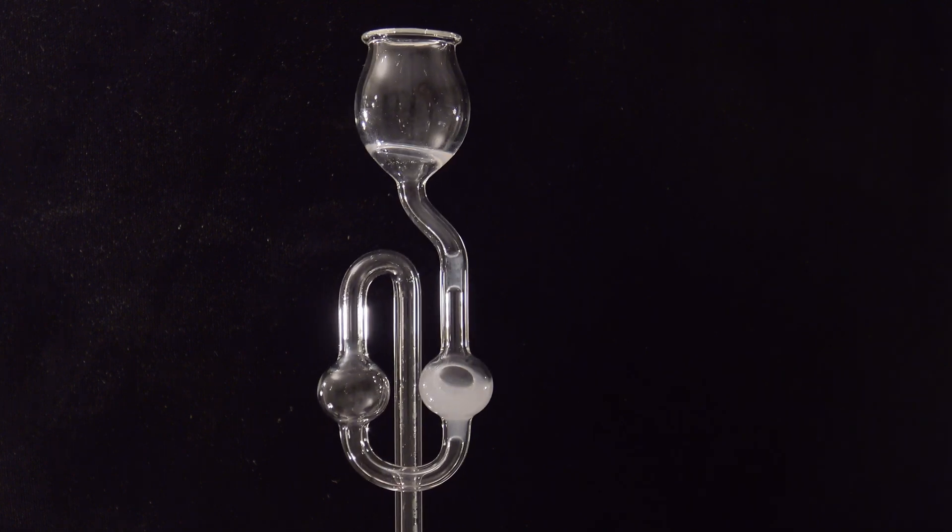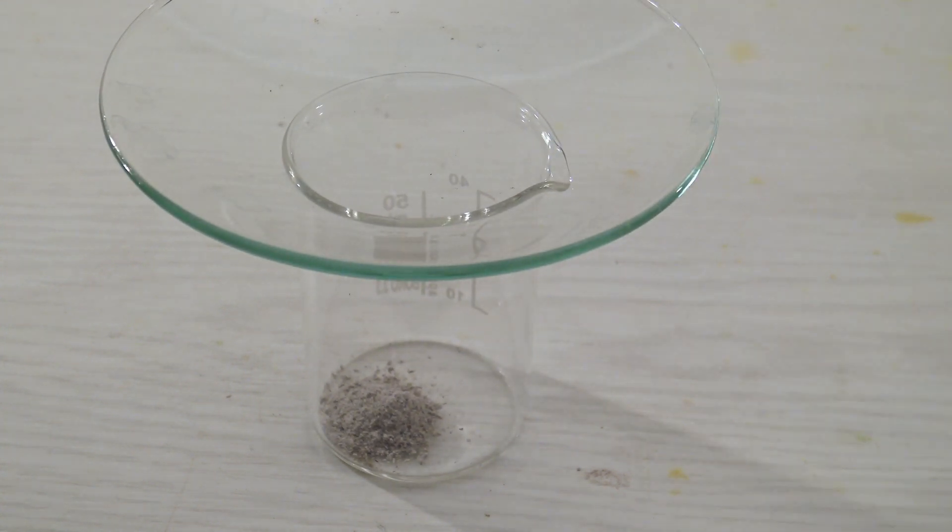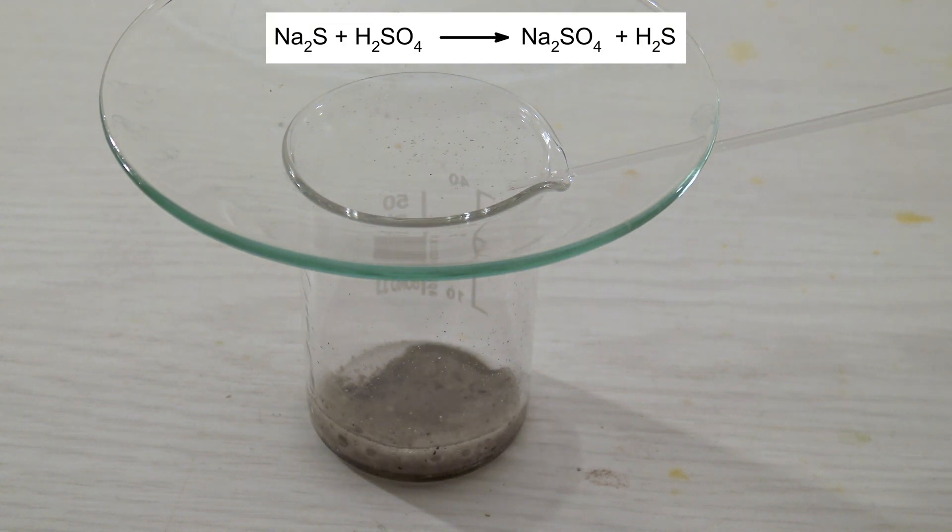When adding the acid, a slight smell of hydrogen sulfide was noticeable. So a watch glass was put on top of the beaker before adding the acid. Then 10% sulfuric acid was added. Hydrogen sulfide is formed when sulfides react with acid. As an example, sodium sulfide is used in the equation.